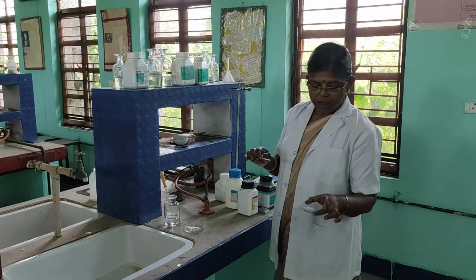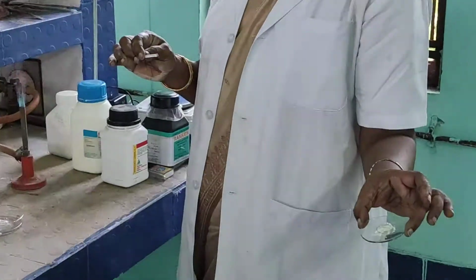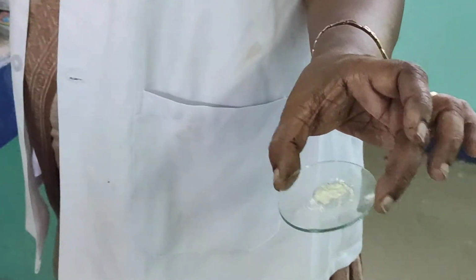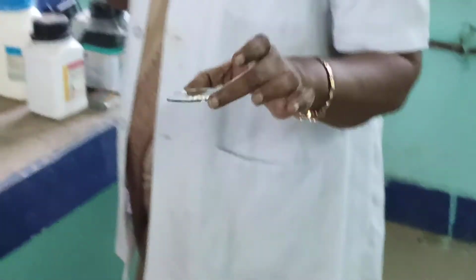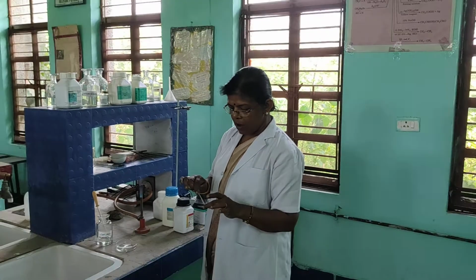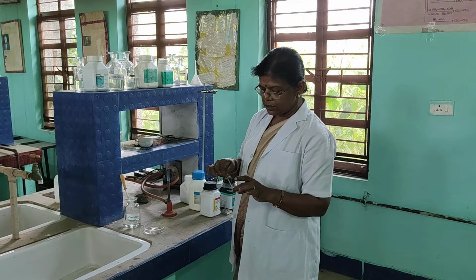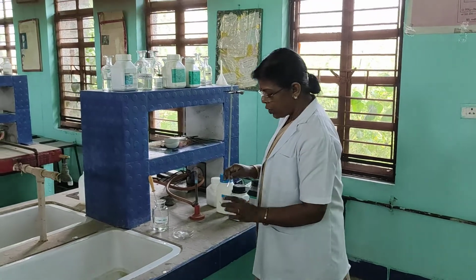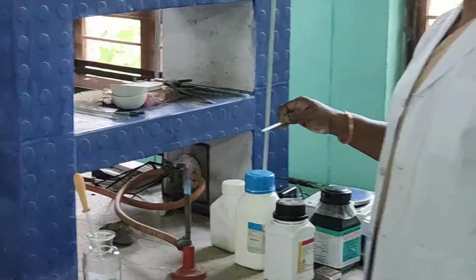Now I have made a paste of the salt with concentrated HCl. I am dipping the loop in this paste, and I will show it to the non-luminous Bunsen flame.